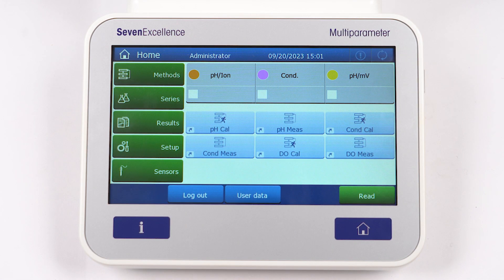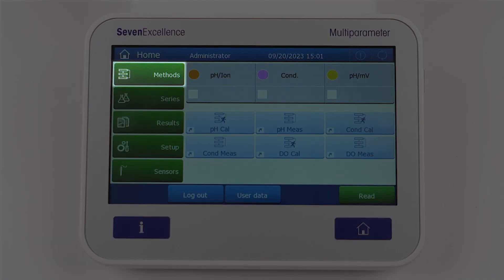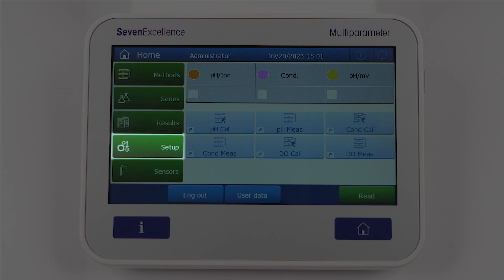On the left side of the screen, you'll see 5 menus with key functions: Methods, Series, Results, Setup, and Sensors.